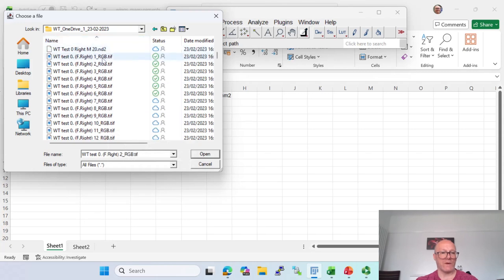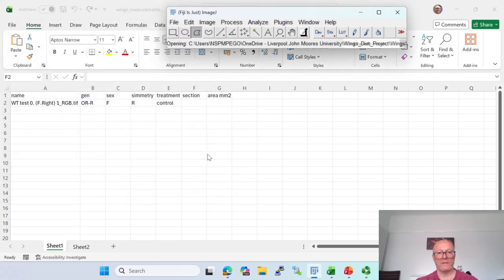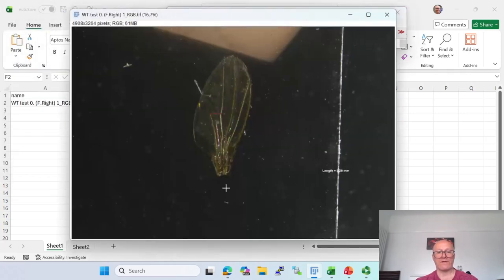And let's open the first one. This one is a TIFF file. And as you notice the name, it is the same that I already wrote in the Excel file. So let's open this one. So open. And here we are. So this is the wing.